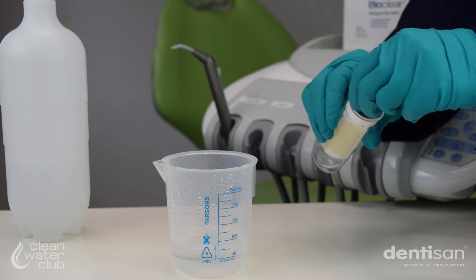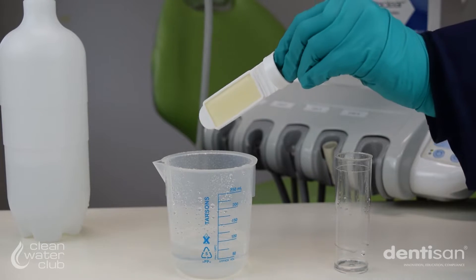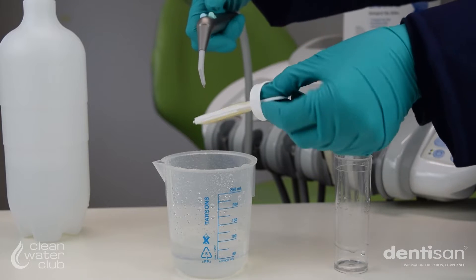For the output water, take a second dip slide and spray each side of the paddle liberally with water straight from the three-in-one line, ensuring the paddle is completely covered.